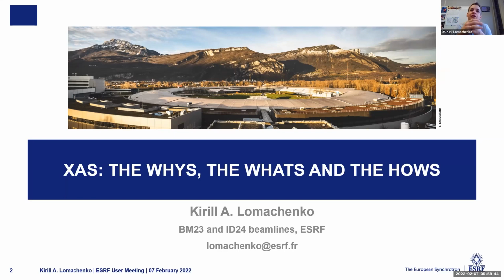In this case, with or without flow, you would have, I think, minor changes, and coupled with a very low scattering amplitude of lithium, you would probably see hardly any change in EXAFS. But it may happen that the flow of lithium ions would change the average oxidation state of other species that are in the electrolyte. Why not?